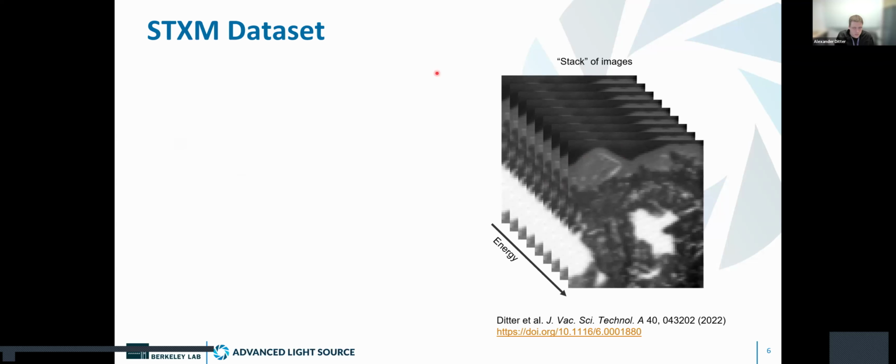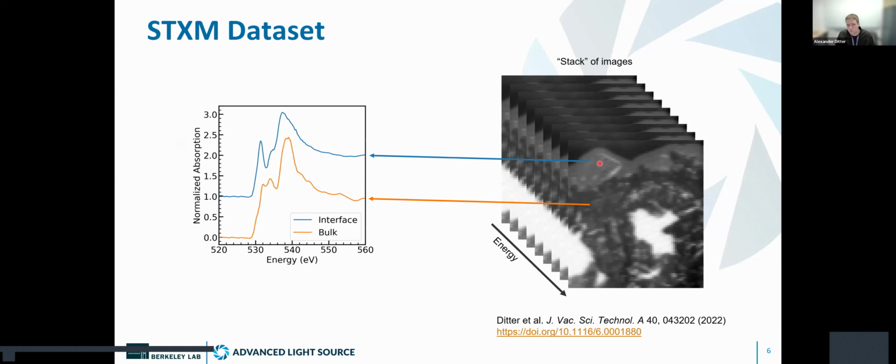This is demonstrated here. Basically you look at this region and we get one species of uranium oxide here. This is, I believe, a uranyl species. And then this bulk region, what I've labeled bulk on the left here, is a different uranium oxide species. And so here we're doing spectral microscopy, kind of chemical imaging, basically.